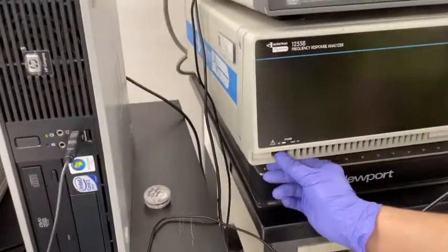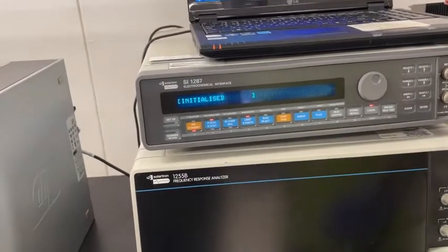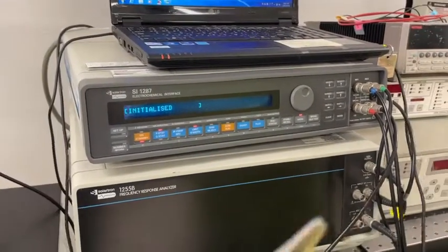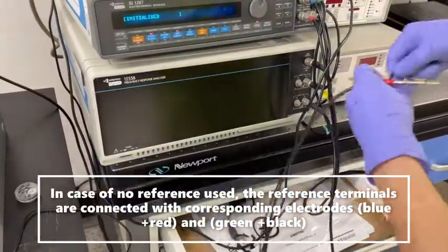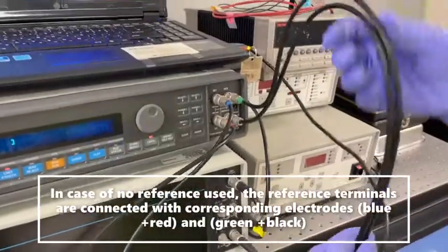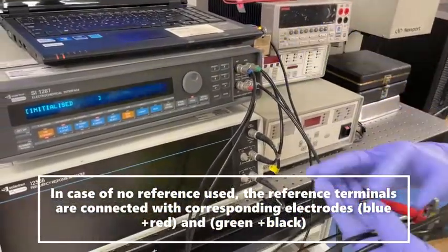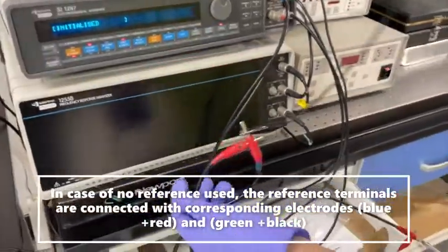And then press. Yes. This? Yeah, right. So just wait for a moment. And then these are the two wires. This is from okay. And then these two wires all together connected together, and these two all wires connected together, and that can do it with respect to some reference, but I'm not using any reference. Yeah, I'm using directly.